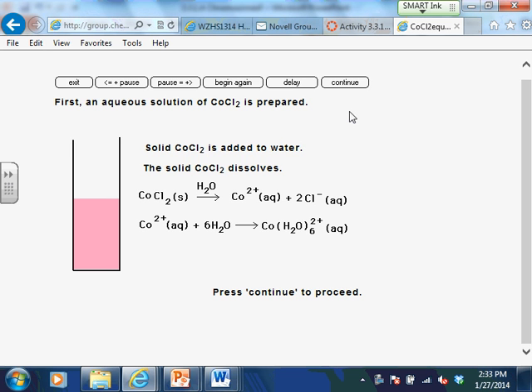So if you remember the coordination complex rules we talked about earlier in the year, that breaks the rules a little bit, in the sense that it doesn't break the rules, but it's kind of an exception. You would expect this to be a Co3+ because it's forming a complex of 6 ligands, and usually the ligands are twice the charge, but here it's actually forming with 6 H2Os. So that can happen. All right, so let's keep going on the simulation here. So now we've got the cobalt with the H2O, and it turns a pink color when it complexes with the water.